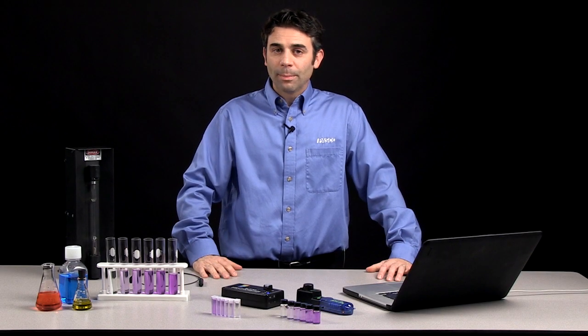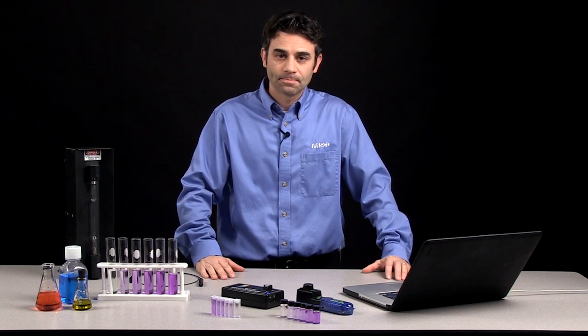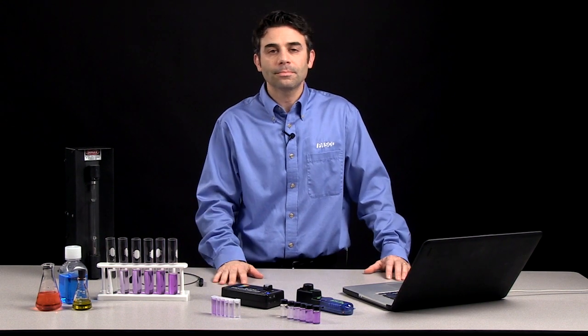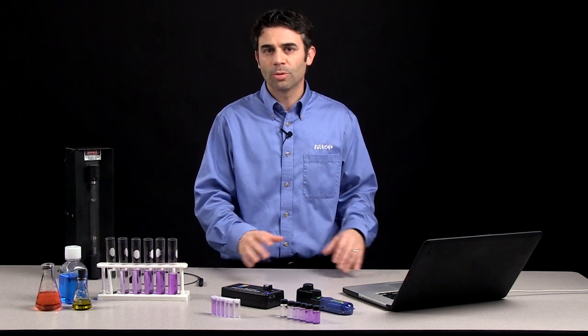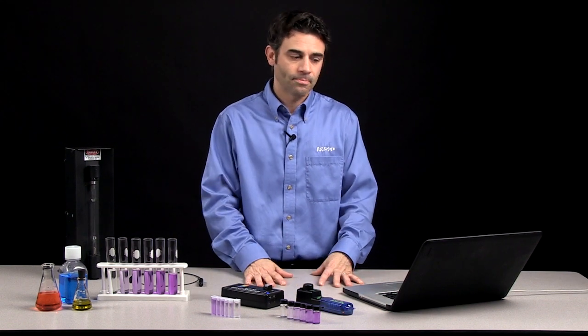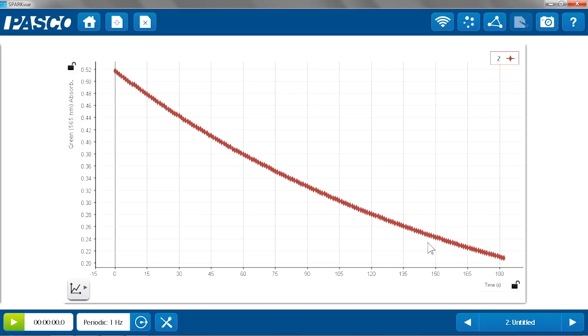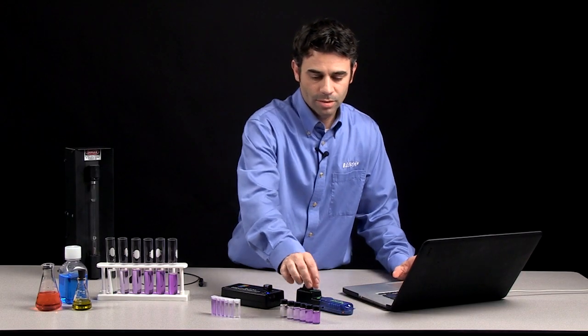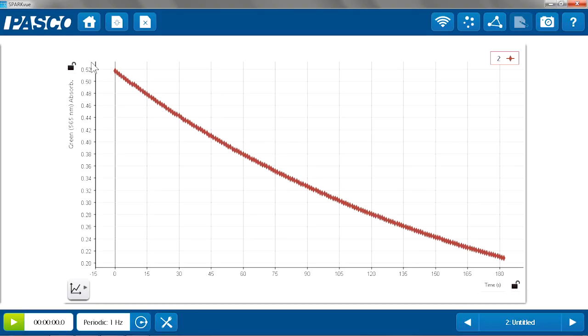So one of the other useful applications of both the colorimeter and the spectrometer is to do some kinetic studies. So in this case, again, I used my crystal violet, and I reacted it with some sodium hydroxide in order to determine the rate law and order of the reactant of the crystal violet. So in the case of the colorimeter, using SparkView software again, I have a green absorbance versus time page set up. And I simply added some sodium hydroxide to the crystal violet, put it in, started collecting data, and allowed this graph to populate.